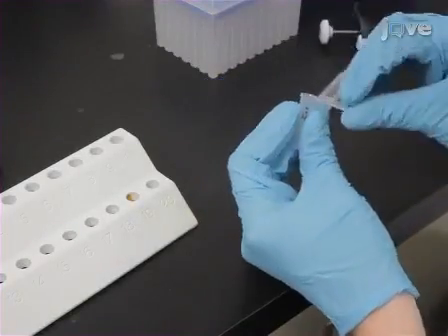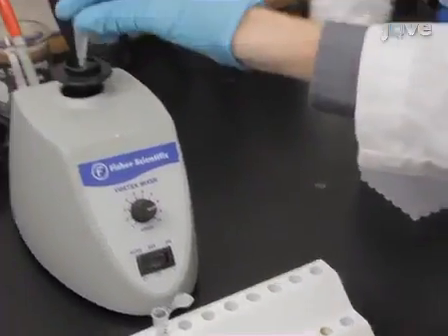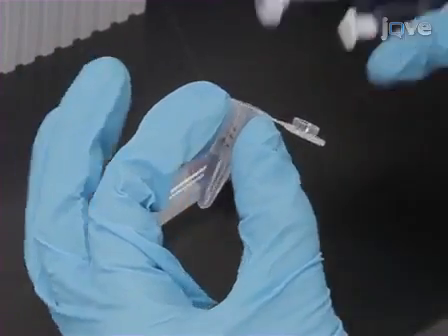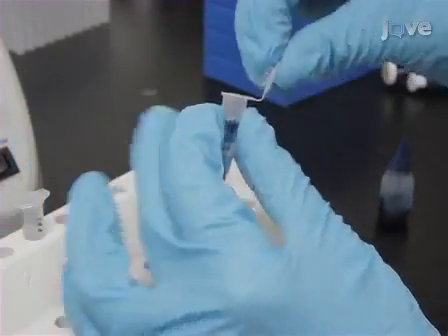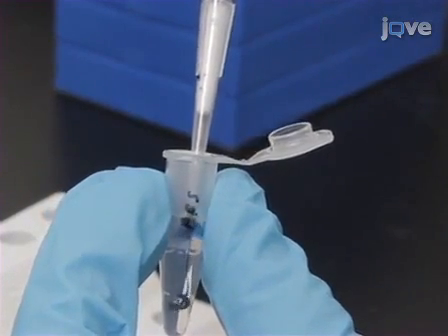To make the insulin solution for injection, dissolve bovine insulin in phosphate-buffered saline to a final concentration of 0.01 mg per milliliter. Also prepare a control solution containing only PBS. Add blue food coloring to both the insulin and control solutions to a final concentration of 0.5%, and keep both solutions on ice throughout the entire procedure.